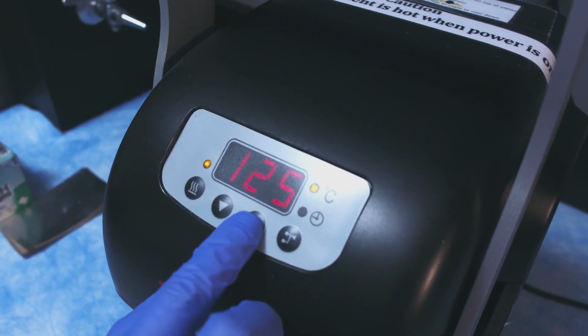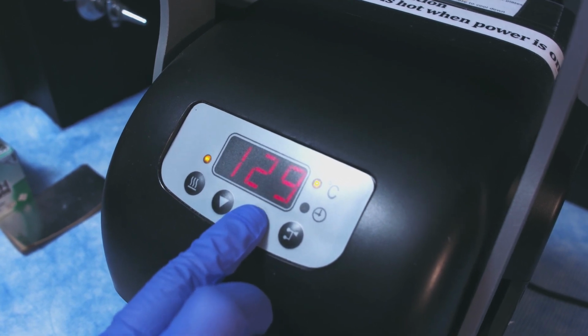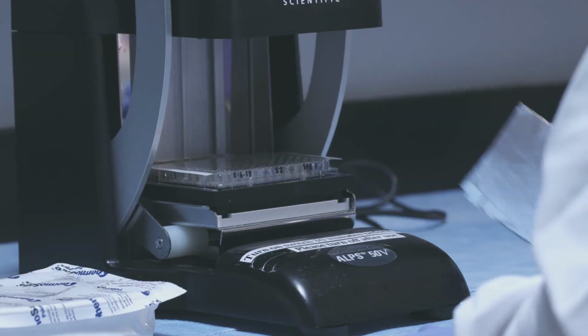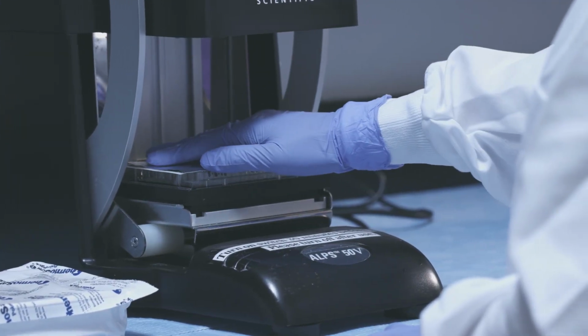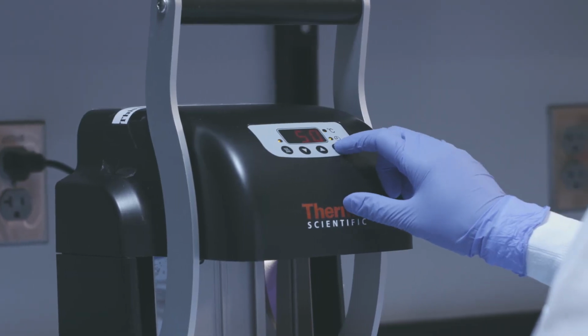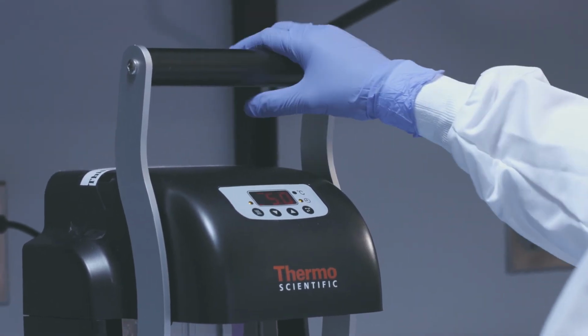Preset the plate sealer to 130 degrees Celsius. Once the temperature is stable, place a piece of aluminum foil on top of the sealing membrane to protect the samples from heat. Place the plate on the holder and apply heat for 5 seconds.